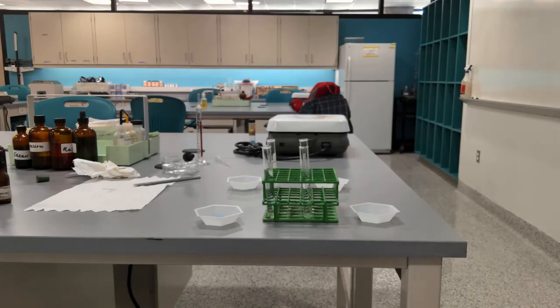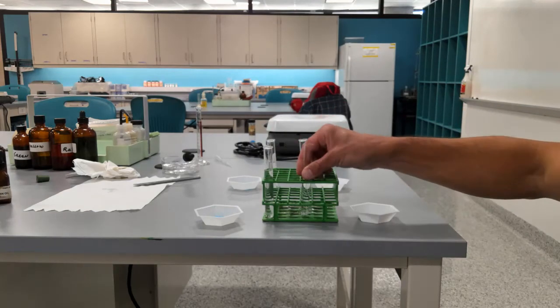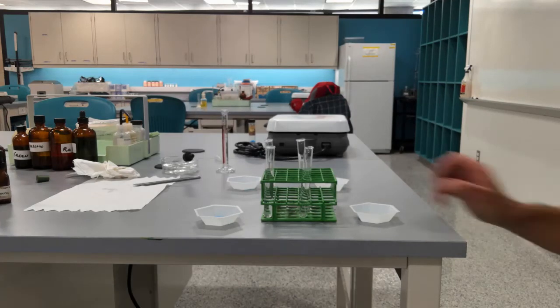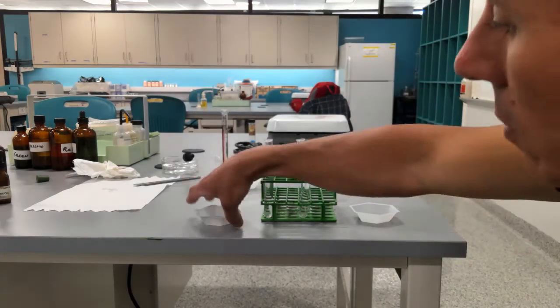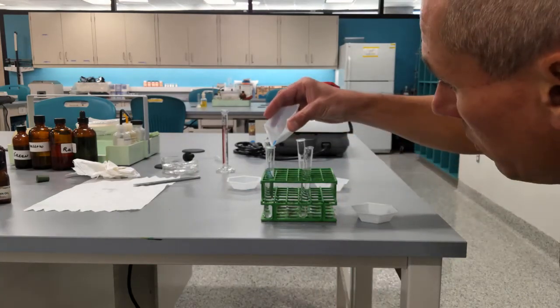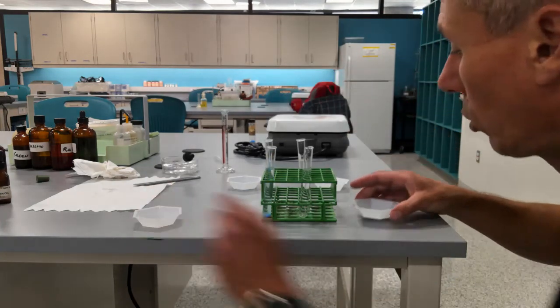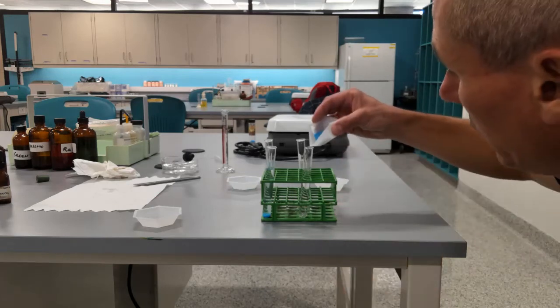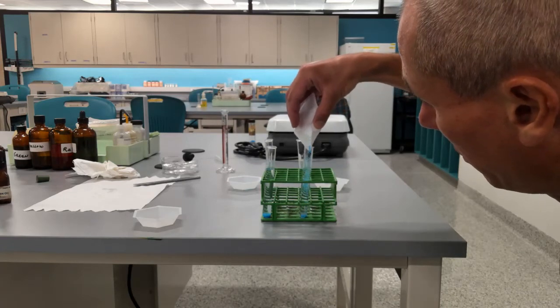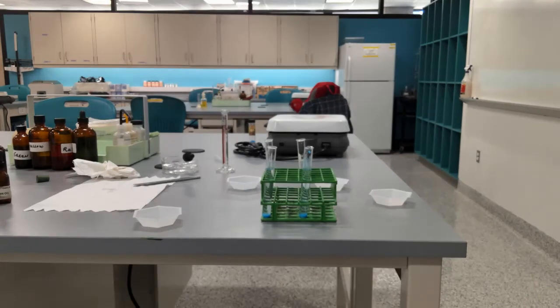For the first experiment, which will be the temperature comparison. So this is the cold water. This is, well, I have to refill it with the warm water again. So here we are. The water is refreshed, and we're going to pour some copper sulfate in the colder water, and some copper sulfate in the warmer water.